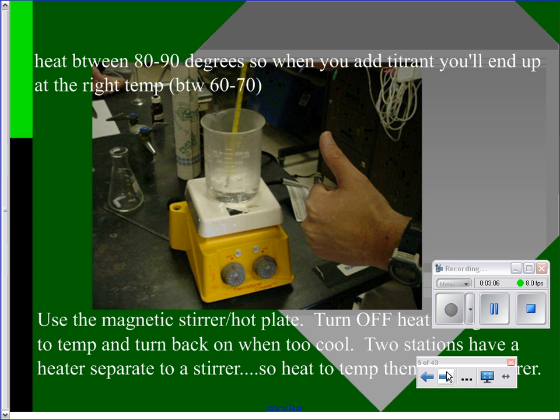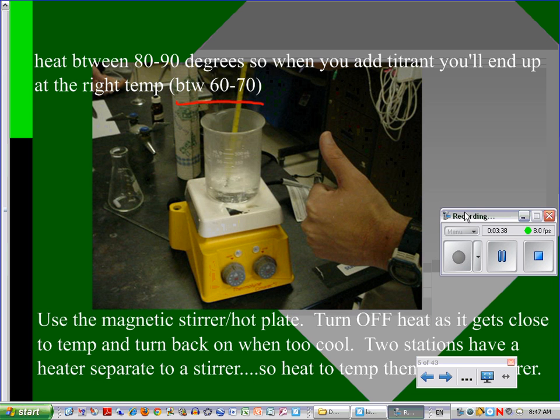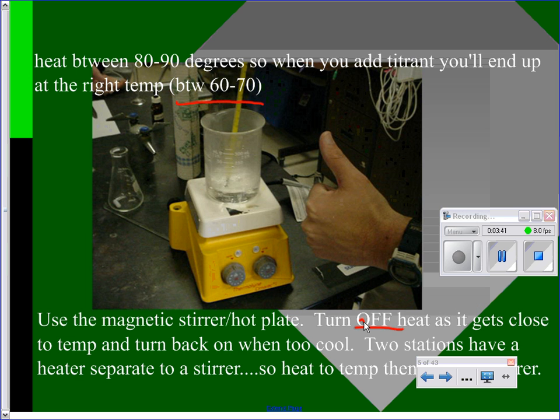Then you're going to heat this sample. Most of you have a heater magnetic stirrer combo. You're going to turn on the heat and the stir at the same time, and you're going to heat it. Your goal is to be at your endpoint, or your equivalence point, between 60 and 70 degrees. So I say heat it up to about 80, and then start your titration. The titrant is going to cool it down as you add it. When you hit that 80 or 90, though, because you're on the hot plate, I would turn the heat off right when you hit it, and then continue with the stirring, and then get to that end point.